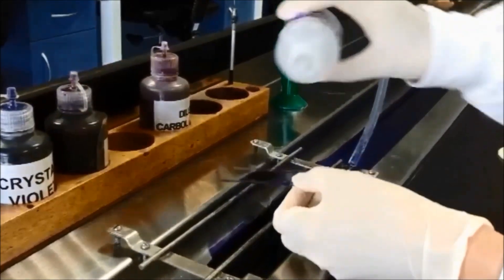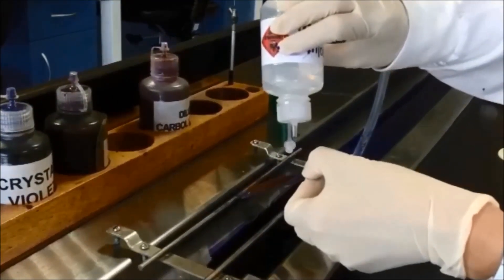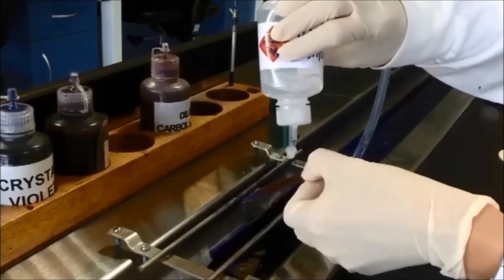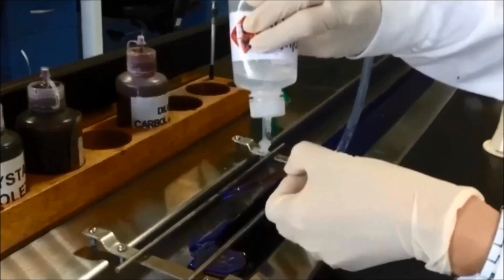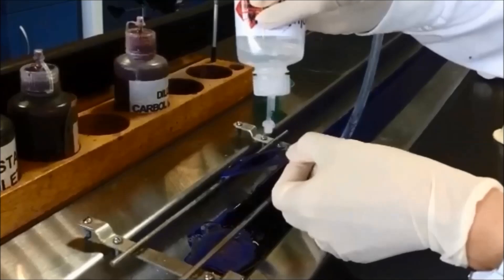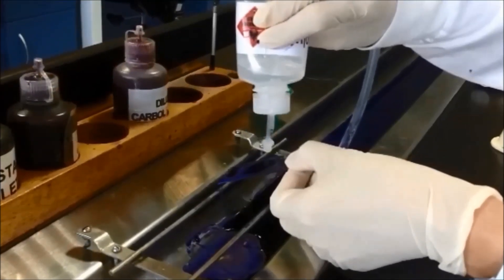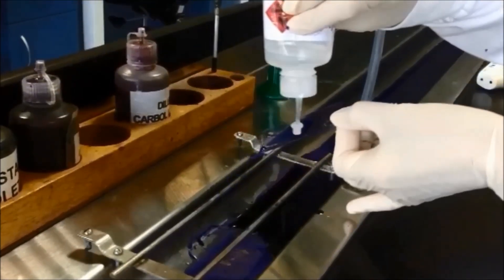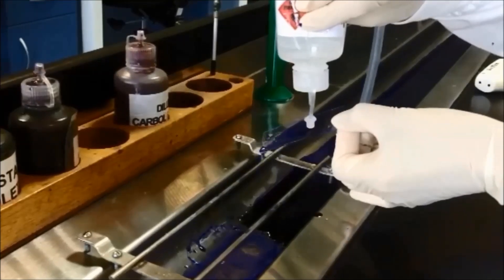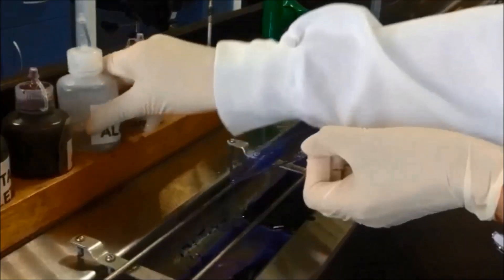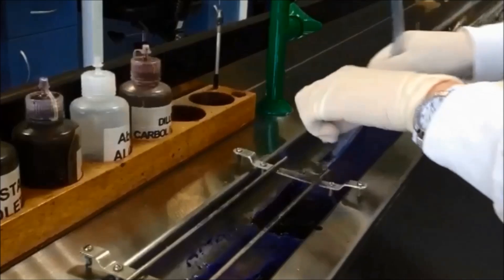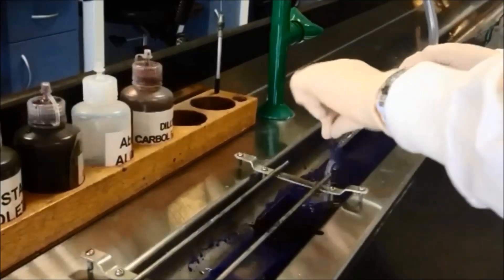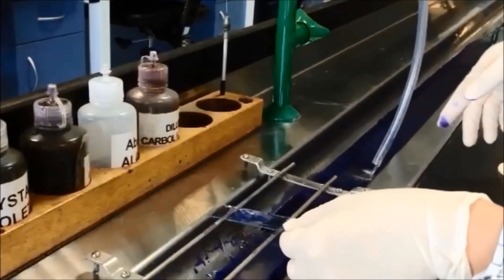Holding the slide at an angle, decolorize with alcohol, adding the alcohol drop by drop until no more color comes out of the film. It is important not to decolorize for too long. With thin films, decolourization is usually complete within 5 seconds. Thick films may take longer. Wash with water.